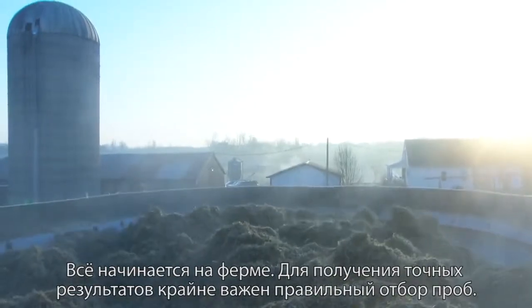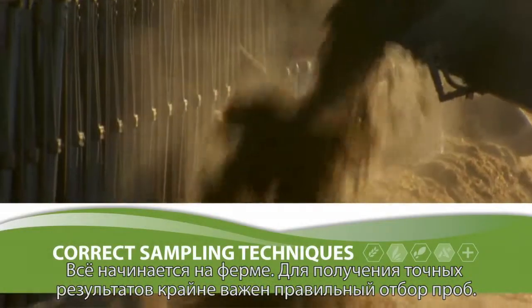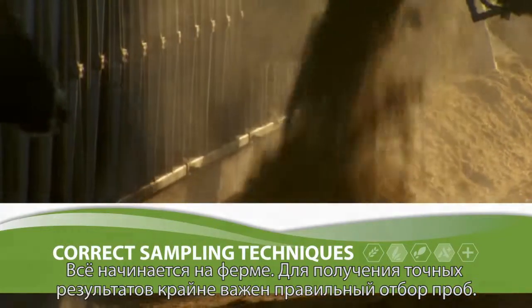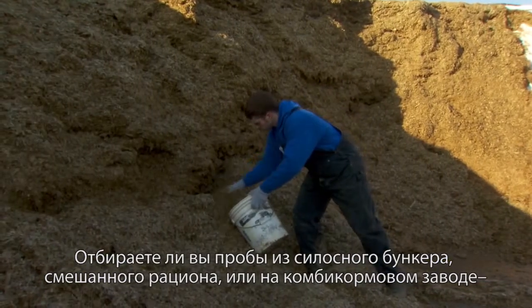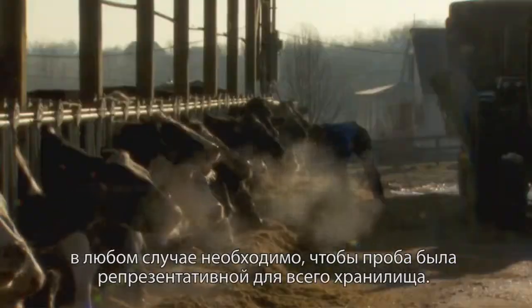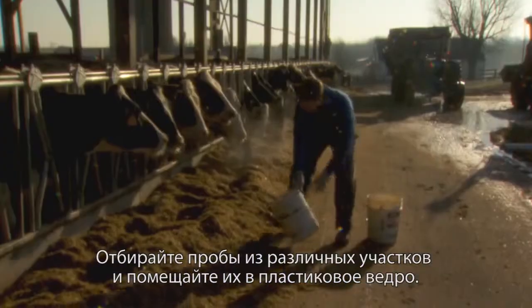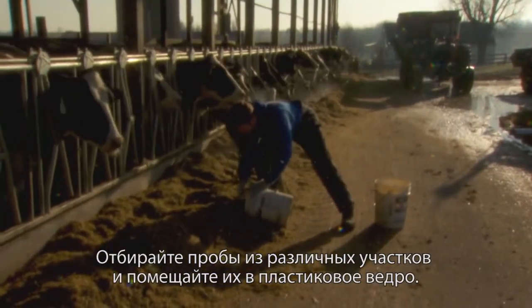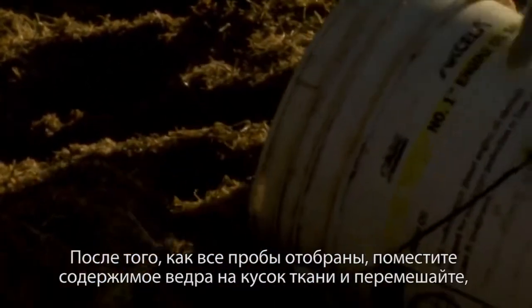It all begins on the farm. Using the correct sampling techniques is vital for producing the most accurate results from the program. Whether you're taking a sample from a silage bunker, total mixed ration or feed mill, it's important to get a thorough sample across the entire area. Be sure to pull several samples from multiple areas and place into a plastic bucket.